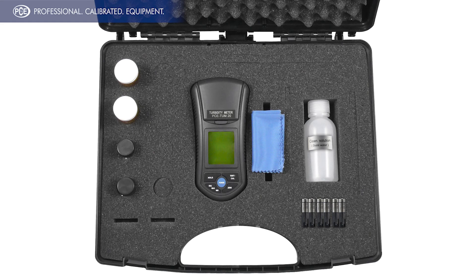Furthermore, you will find in the complete scope of delivery a cleaning fluid, a clean cloth, two measuring cuvettes, and six suitable batteries, all housed in the instrument case.